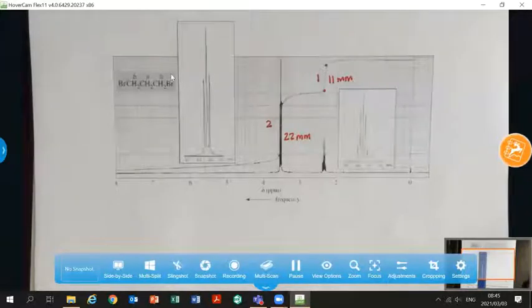So I cheated a bit here. I gave you the structure on this spectrum. And if you note here, I can't just say that there's 2 hydrogens here and there's 1 hydrogen here. If I do that, I'll be wrong. Because if there was 2 hydrogens here and 1 hydrogen here, that would be 3 hydrogens. And if I look here, I can see there's not 3 hydrogens, but there's 6 hydrogens in this particular molecule, which means that all these integrals should actually be doubled if I want the exact number of protons in the molecule. So essentially here, the ratio of the protons is 2 is to 1, but in actuality, there's 4 protons here and there's 2 protons in this one.